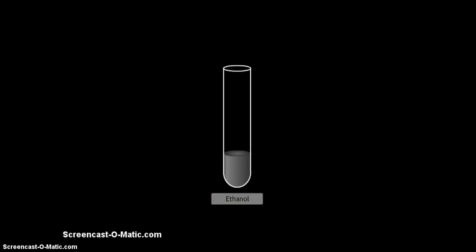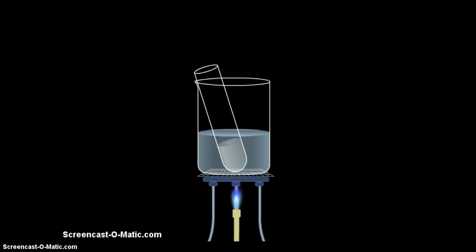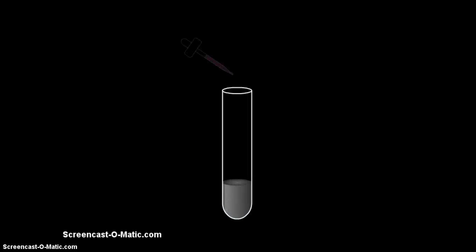Take a small amount of ethanol in a test tube and place it in a water bath. Now, add a 5% aqueous solution of alkaline potassium permanganate, drop by drop to the test tube. The purple color of potassium permanganate disappears due to the oxidation of ethyl alcohol to acetic acid.